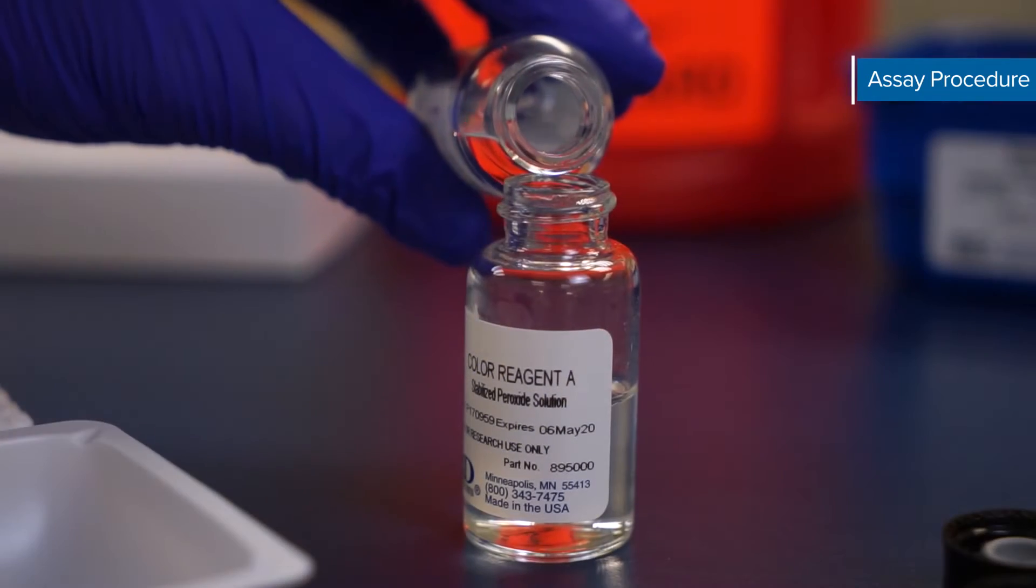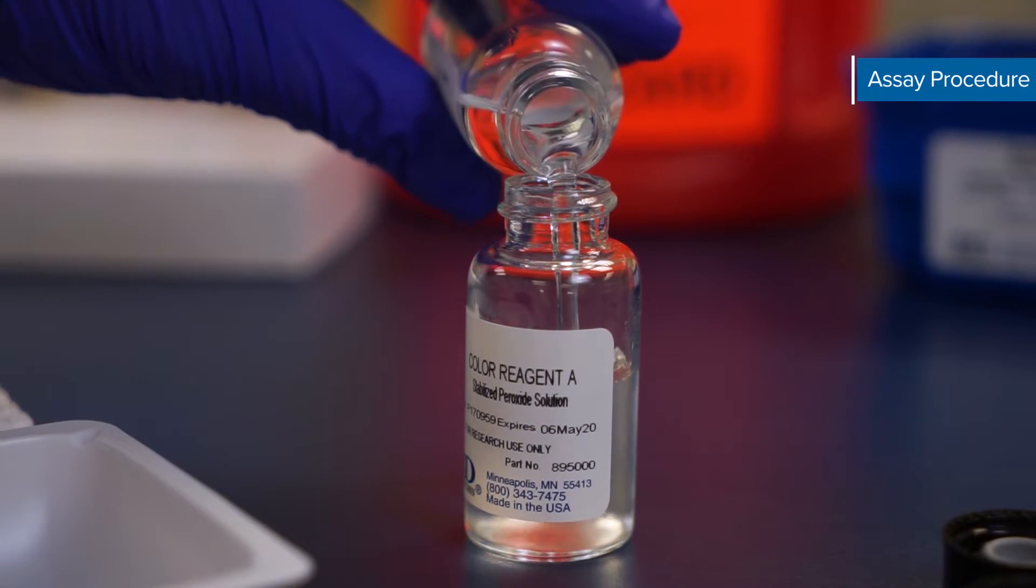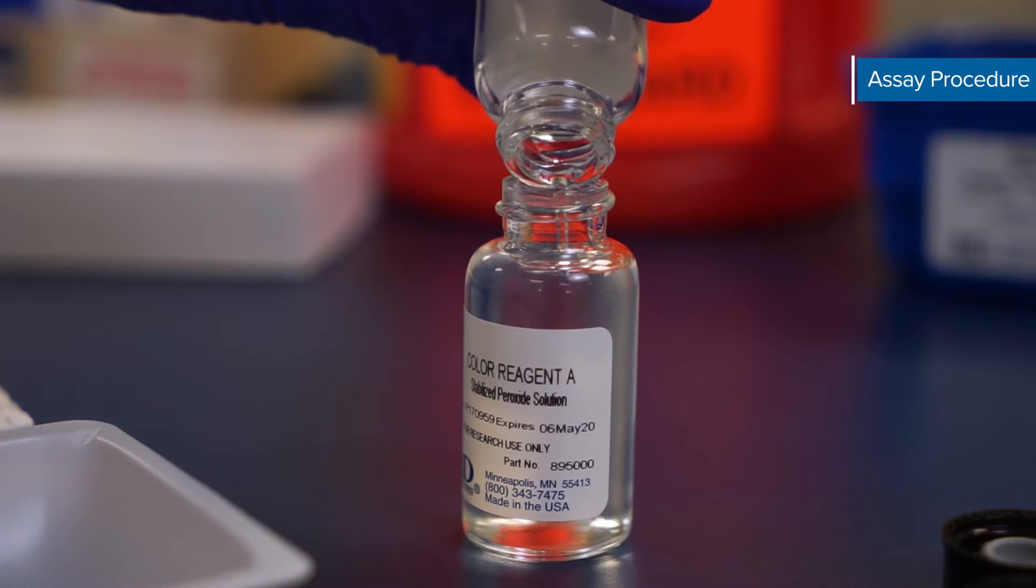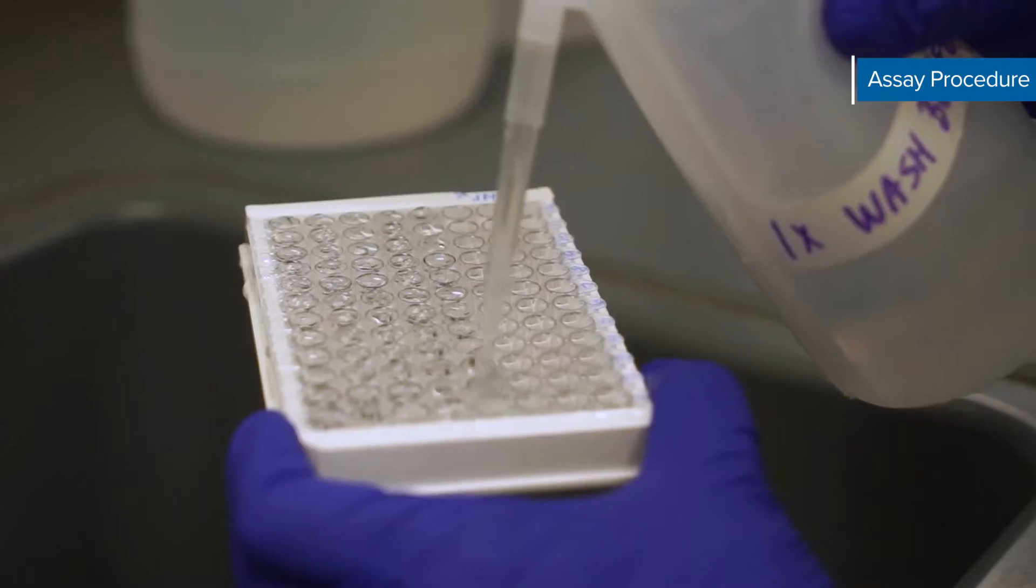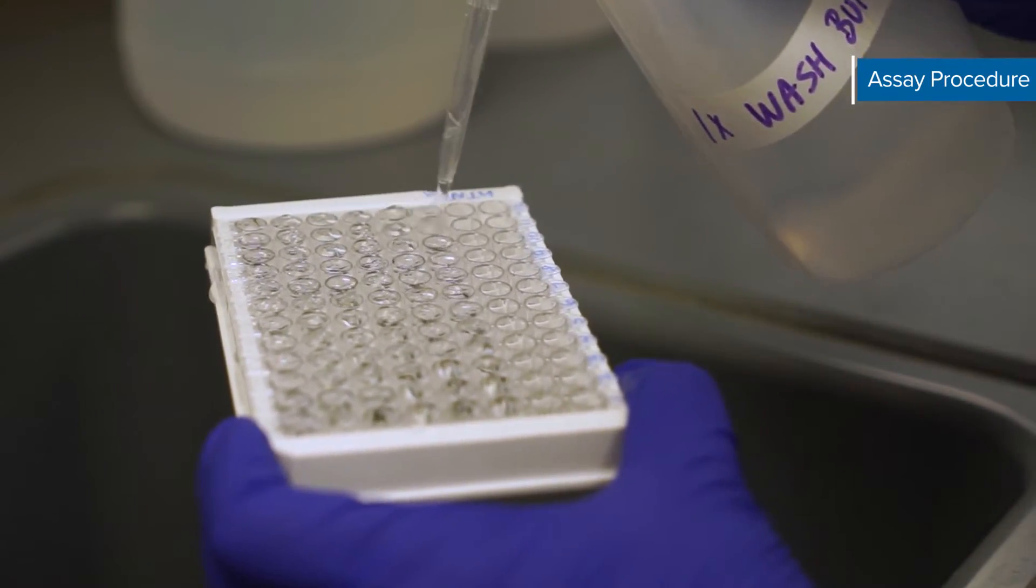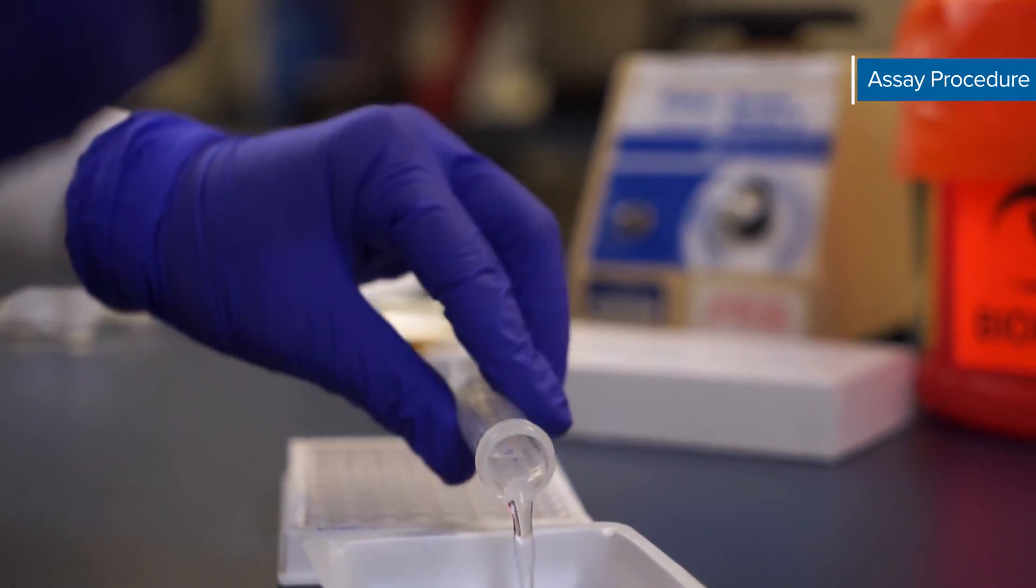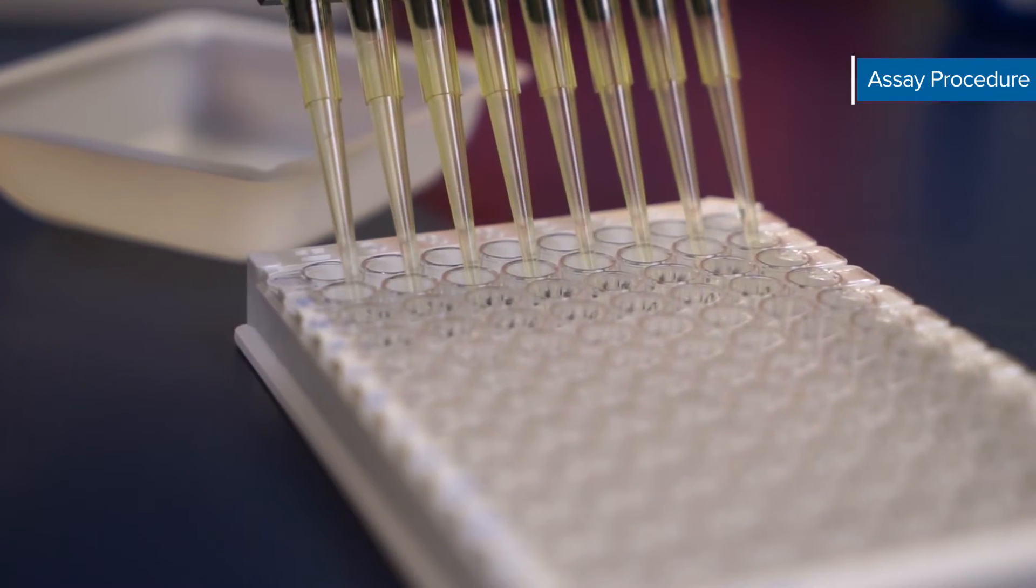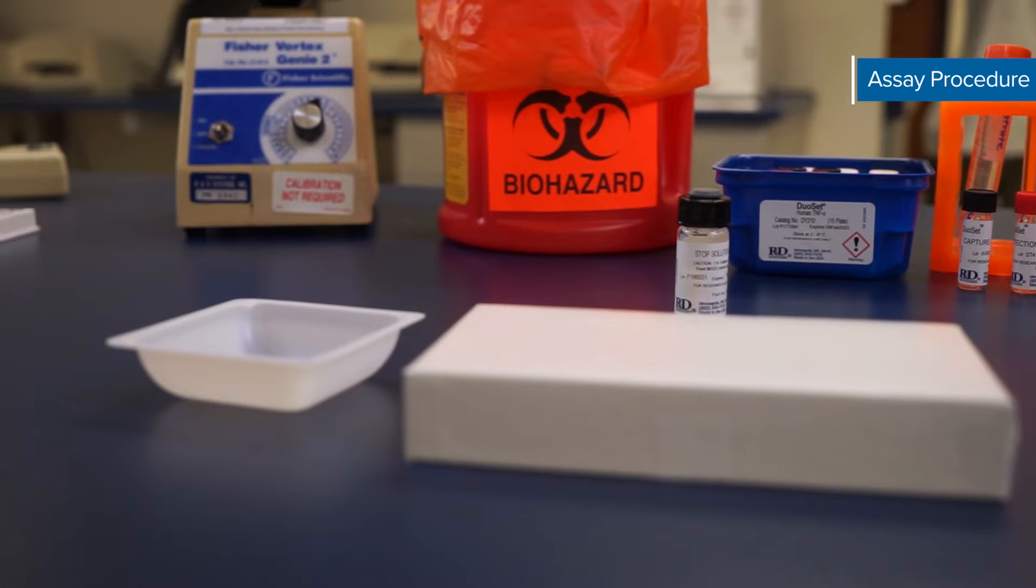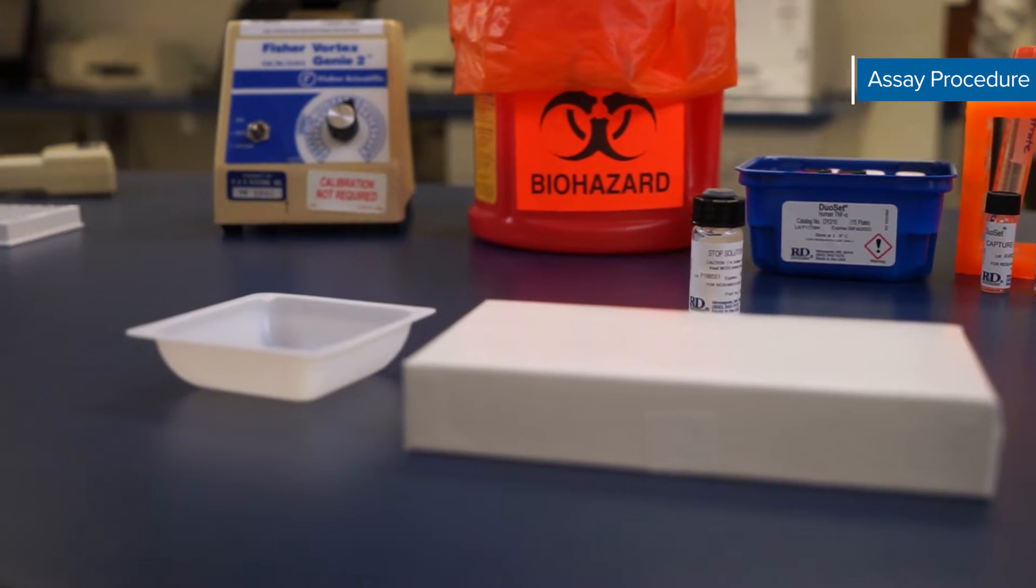In the last five minutes of the streptavidin HRP incubation prepare the substrate solution, a one-to-one mix of hydrogen peroxide and tetramethylbenzidine. Next repeat the wash step. Now add 100 microliters of substrate solution to each well. Incubate for 20 to 30 minutes at room temperature on the benchtop. Avoid placing the plate in direct light.